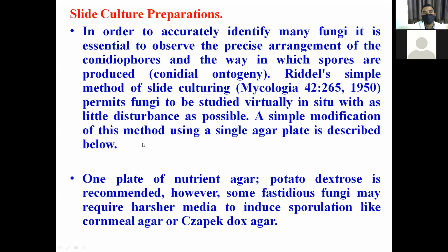A simple modification of this method using a single agar plate is described below. Steps, how to prepare this slide culture. In routine examination in LCB, the mycelia adherent to the glass surface usually show some characters, which may be lost if teasing needles are put, and it happens routinely in LCB. In fungal slide culture preparation, we will take the forceps and put it on LCB and we will see.